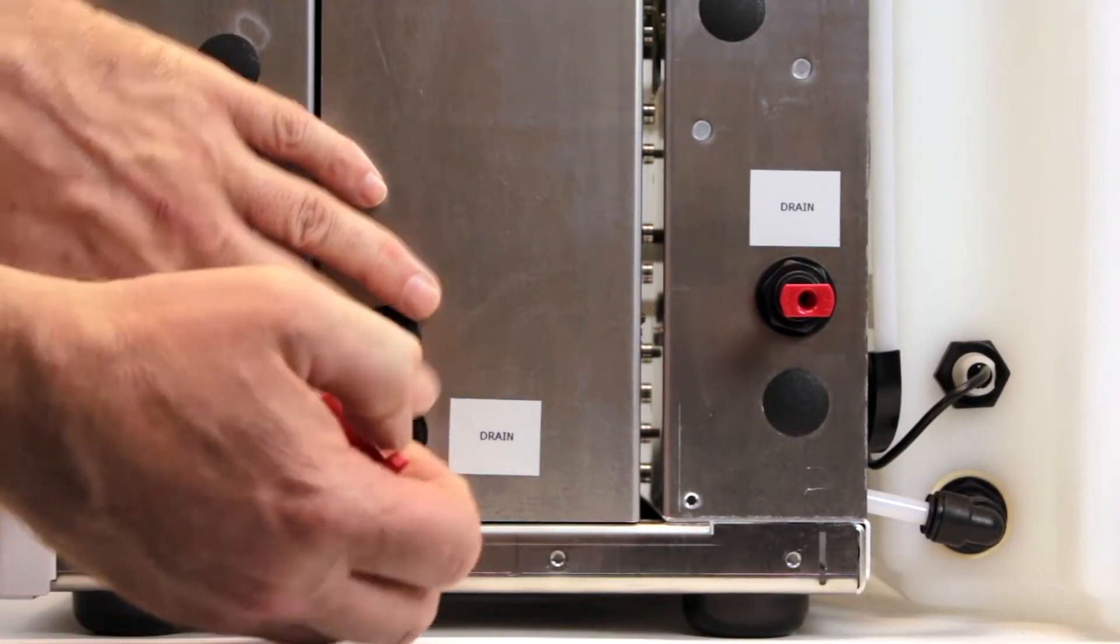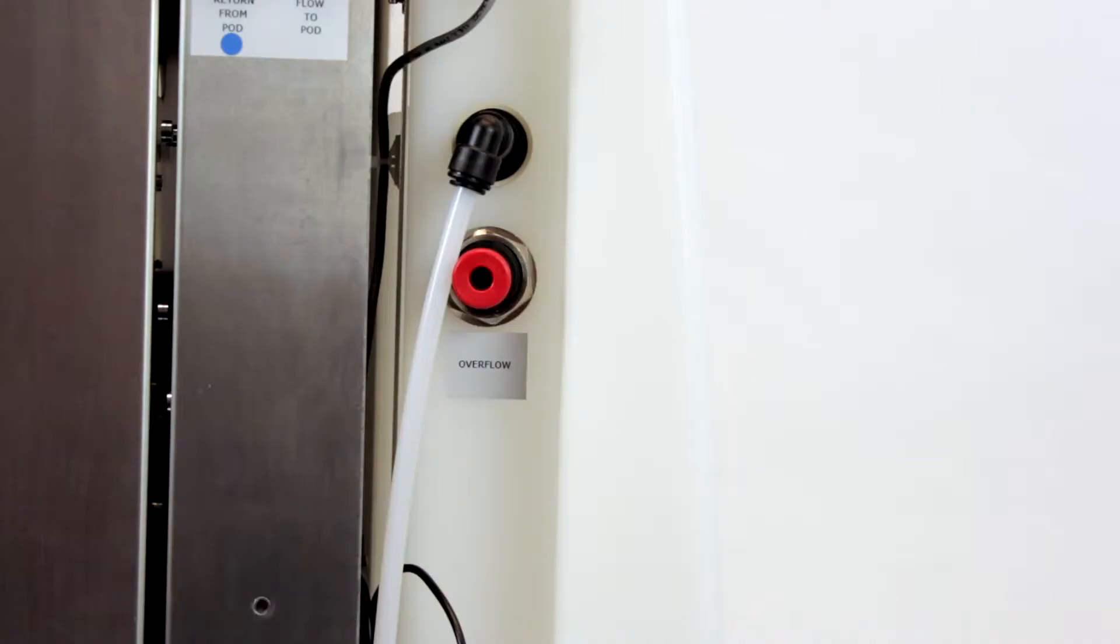First, remove all of the red transit plugs by simply depressing the locking ring and pulling them out.